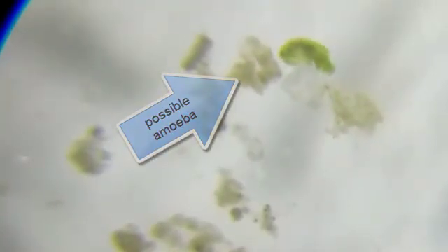Maybe it's an amoeba. It might be an amoeba. So we've got something moving around here. We're not positive what it is. Believe it or not, we don't know everything. Especially pond water.